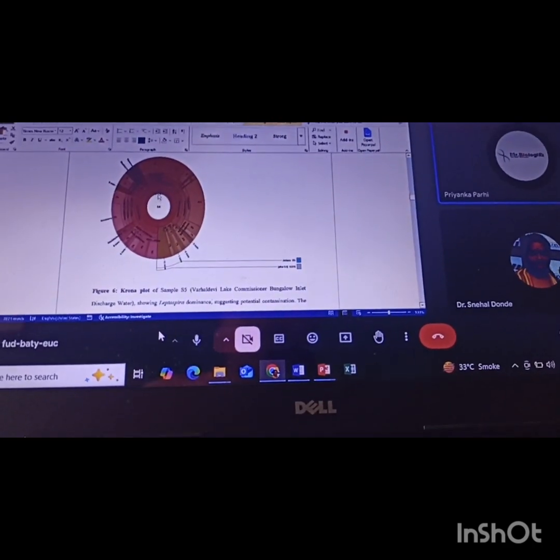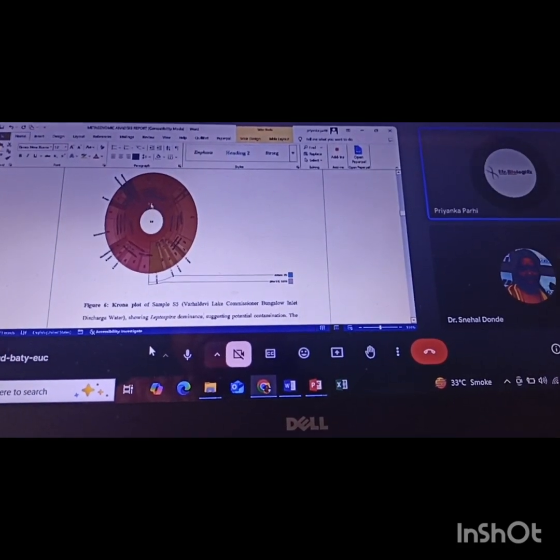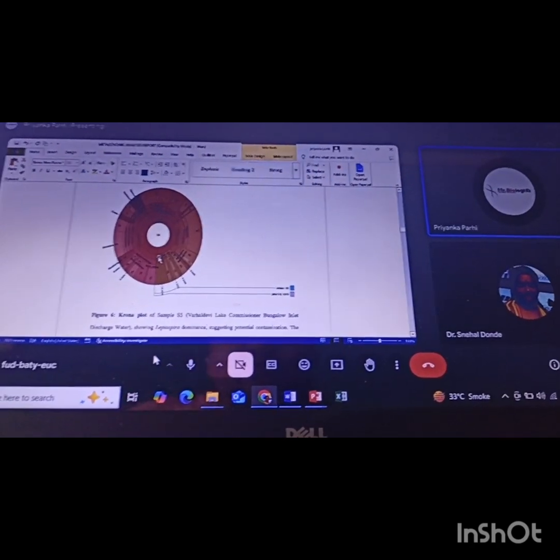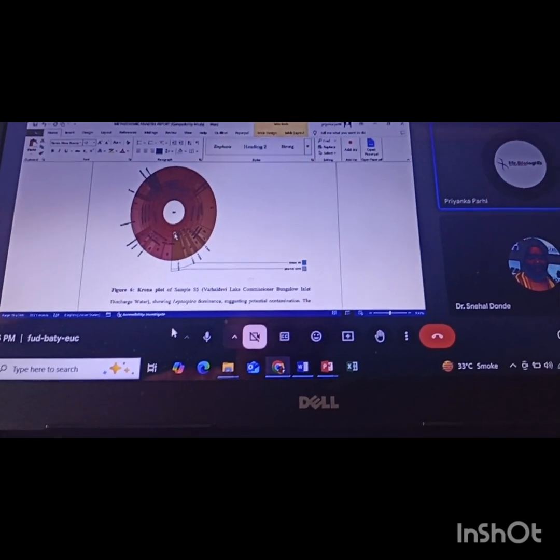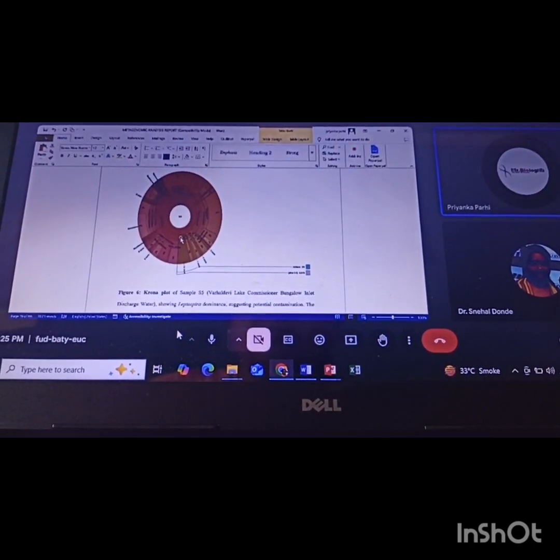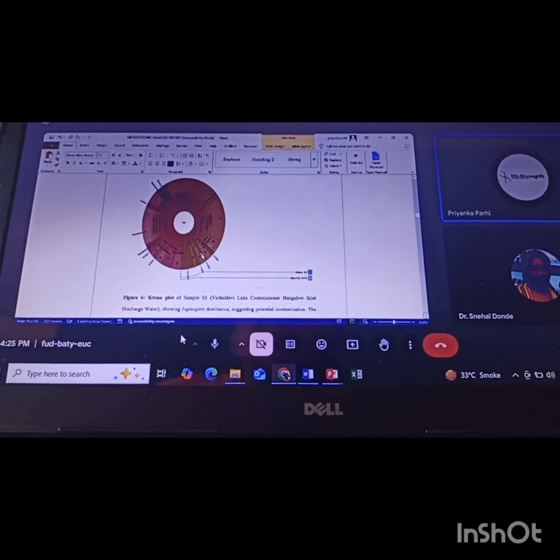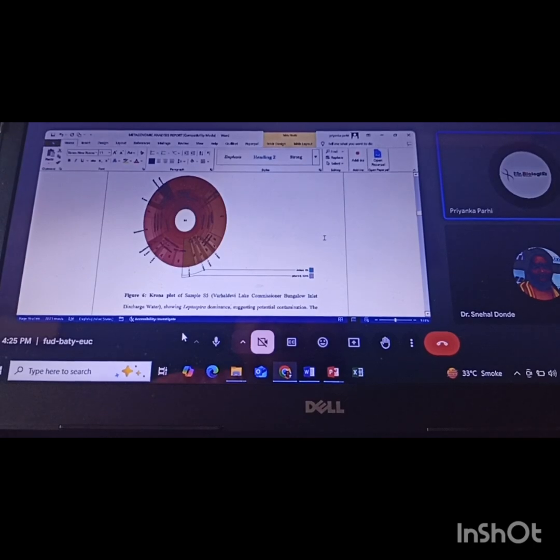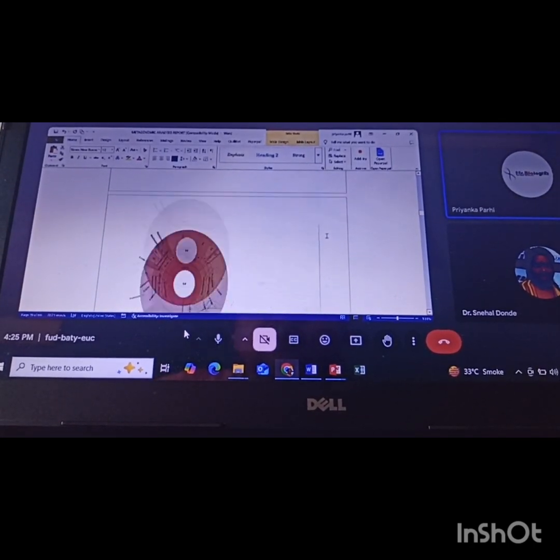No, the closer circles are phylum, then family, order. S7 is the sample, bacteria is the kingdom, then proteobacteria is phylum, bacterio is phylum, this is phylum. It grows, like the closer to the center is the overall larger umbrella. The more the Krona plot is spreading, it goes from order, class, family, genus. So at the end, most of them are genus level, because it's difficult to identify species level. It's very tricky in this situation.